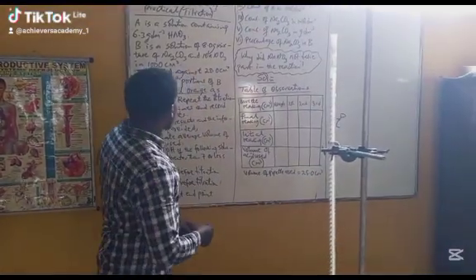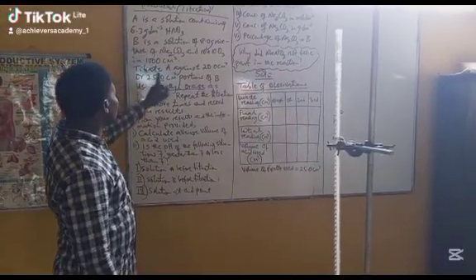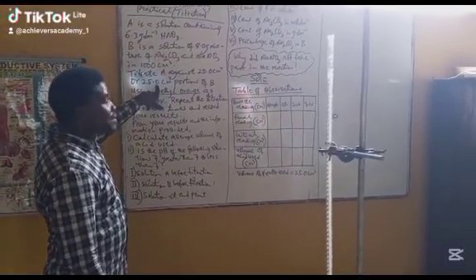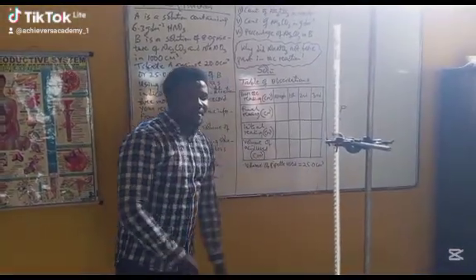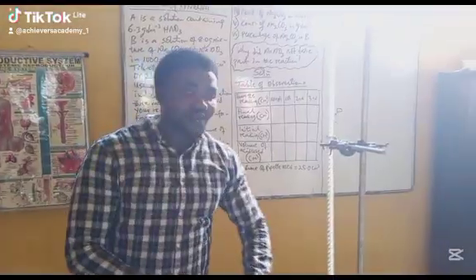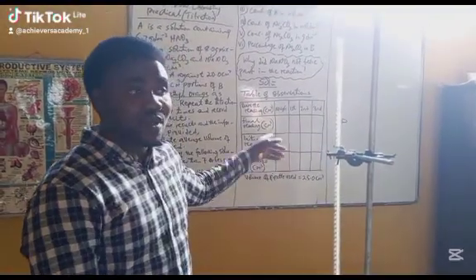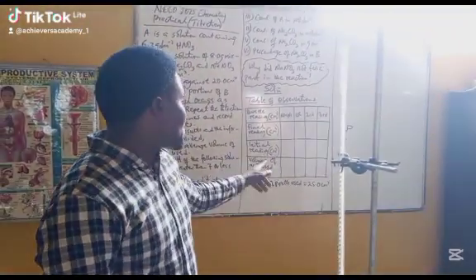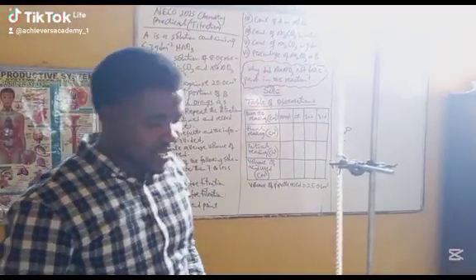Now, since we have the option of using either 20 or 25 cm cube pipettes, we decided to use what? 25. Another center may want to use 20. It's not a problem. That's why you need to state the volume of pipette you use. However, any volume of pipette used will not change your value. Alright, let's begin with the titration.